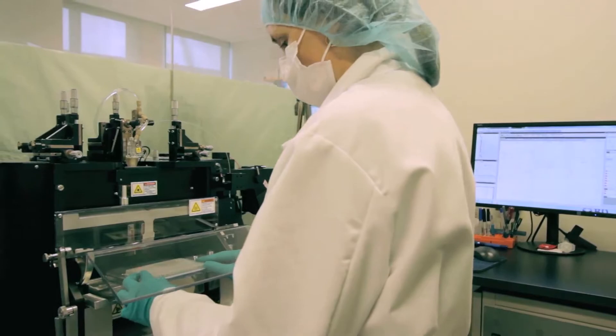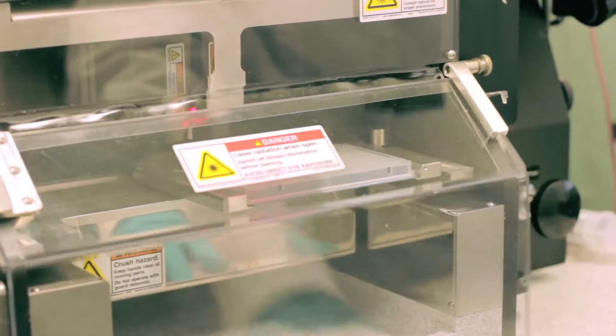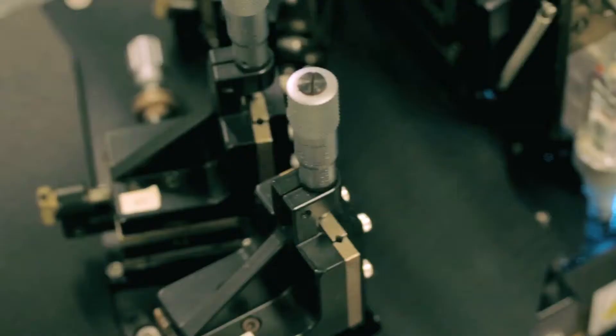At SCGC, we use a fluorescence-activated cell sorter to separate microbial cells one by one into plastic microplates, each containing 384 wells. This is a highly sophisticated, automated instrument that can complete the process in a matter of a few minutes.